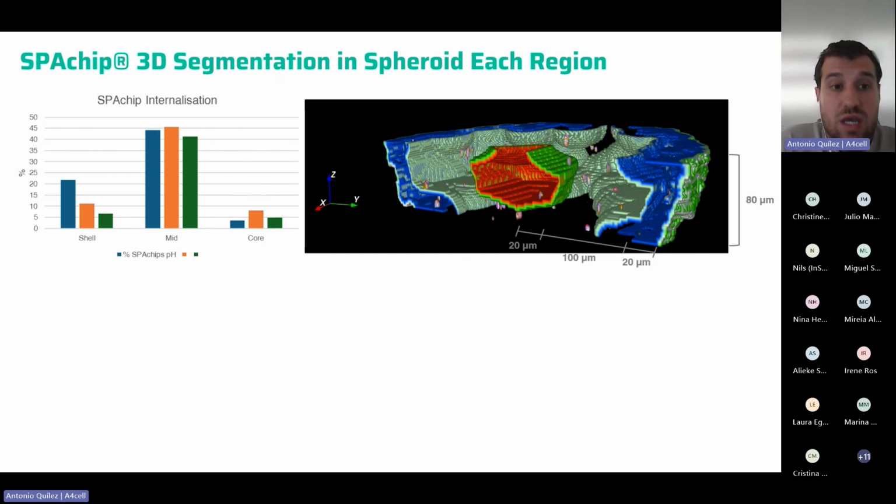And what we can see is that there are more chips in the shell in smaller samples. What was surprising for me, and I'm just assuming that it's because I defined the same shell in terms of length, and I should have done it in a relative manner to the whole volume of the cell.